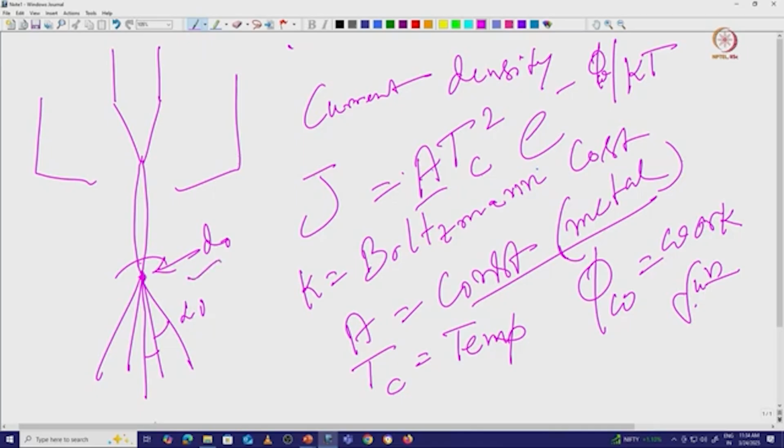If we get the proper current density, that will help us do the rest of the experiment. Whenever we set up or install the instrument, there are a couple of things we have to pay attention to: the emission current, the bias voltage, and our total current density.